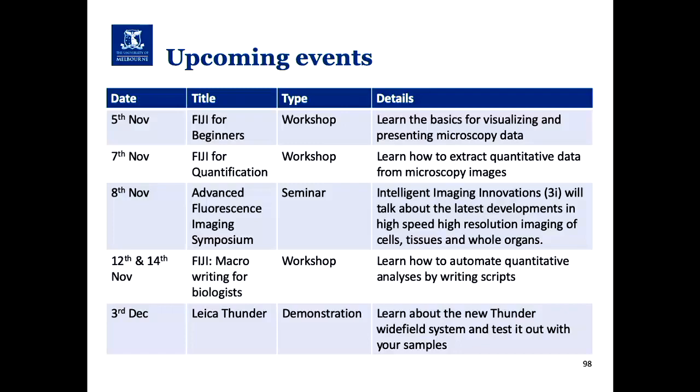And then on the 3rd of December, we have Leica coming in to run a demonstration on their new Thunder system. It's essentially a wide field deconvolution system that works really nicely on thick samples, so up to 500 microns into samples. You can get really high quality imaging.